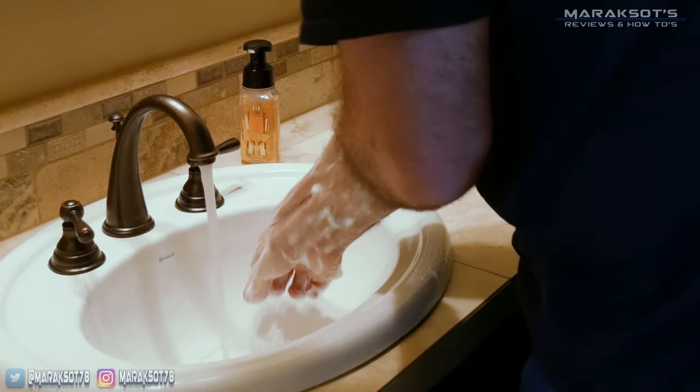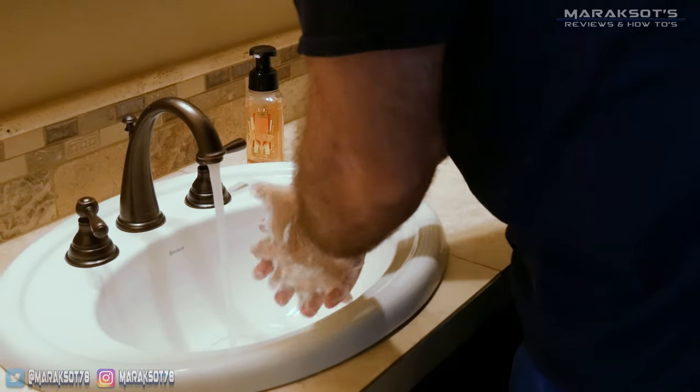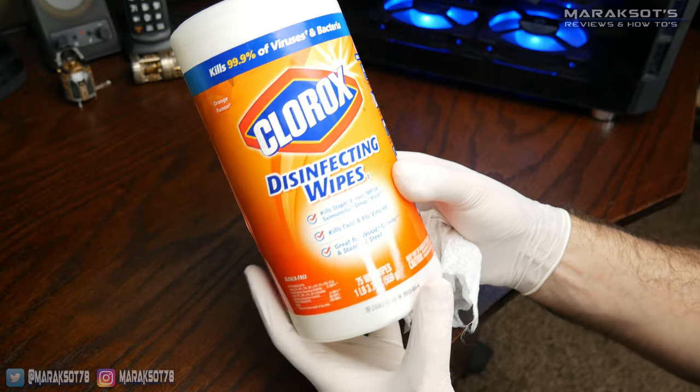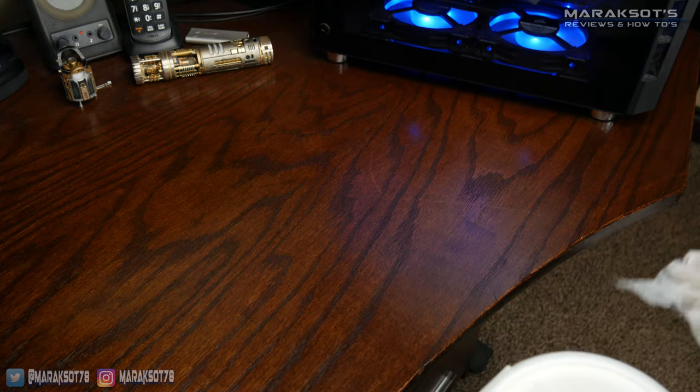Now, I'm not a scientist or anything — shocking, I know — but I wanted to do my best not to contaminate my samples, so I left the kit sealed in its shipping box until I was ready to do my little experiment. Before getting started, I washed my hands really well with soap and water and donned a pair of latex gloves as well as an N95 mask to keep me from breathing on the agar plates. Finally, I sanitized my desk with a Clorox wipe and I was ready to begin.